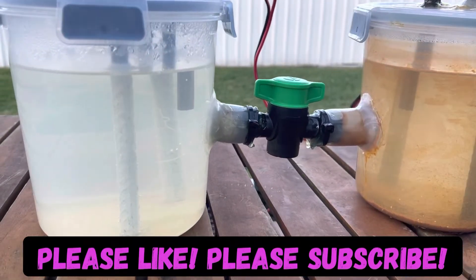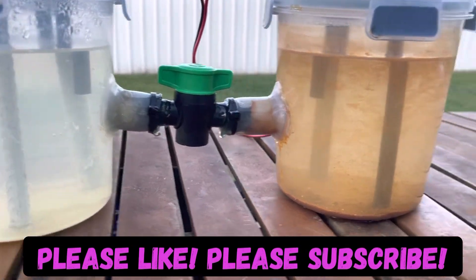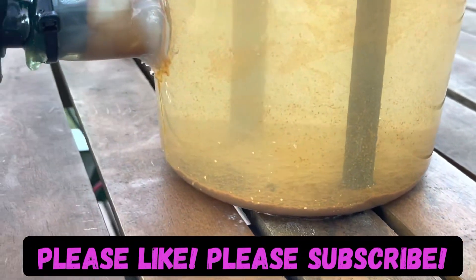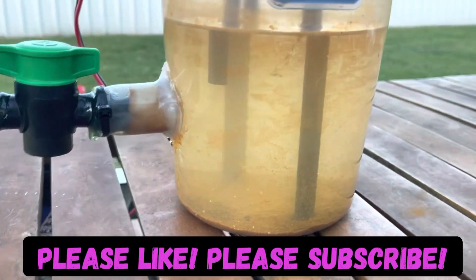At this stage the process has been operating for approximately 41 hours. As you can see, the rust has started to settle out, making a deposit on the bottom here. As far as I can understand, that's iron chloride there, however that is yet to be determined.